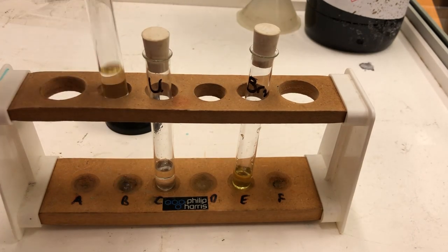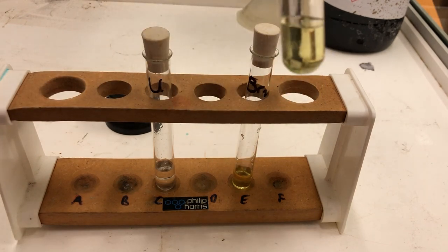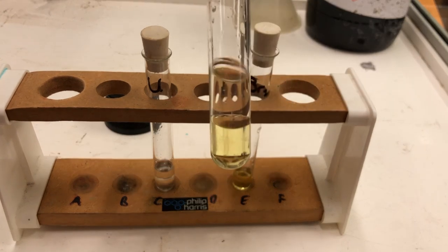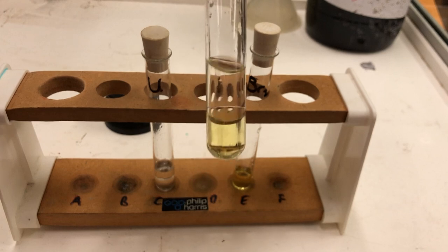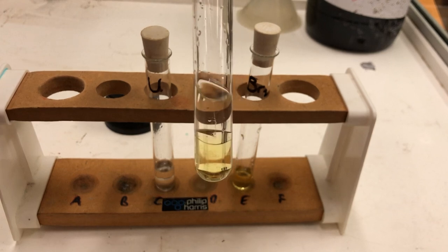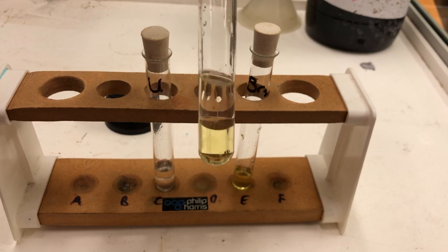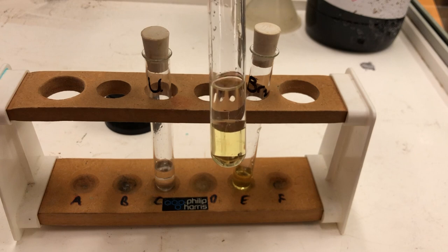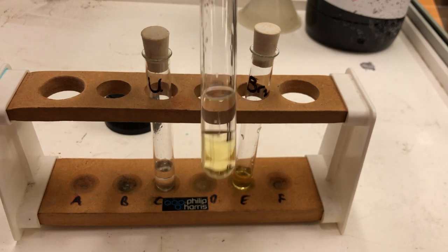When bromine water was added to the hexane, the bromine water is lying at the bottom here and it has remained yellow. There has been no reaction. There's two layers there because the bromine water and the hexane are insoluble. They do not dissolve in each other, but the bromine has not changed. It remains yellow.